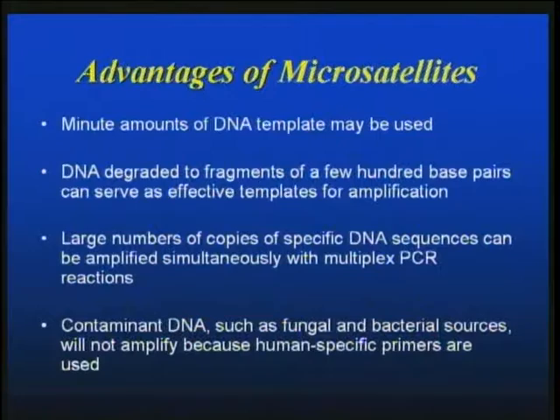It's a multiplex reaction, as I said, so you get large numbers of copies of multiple DNA sequences that are amplified simultaneously. And finally, you don't have to worry about contaminant DNA, such as fungal and bacterial sources, because they don't amplify. The PCR primers are actually human-specific, so you never have to worry about maintaining sterility and worrying about the source.